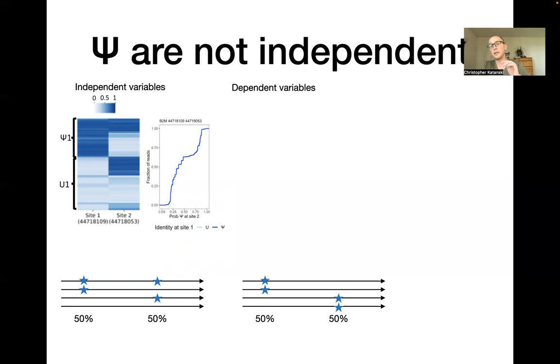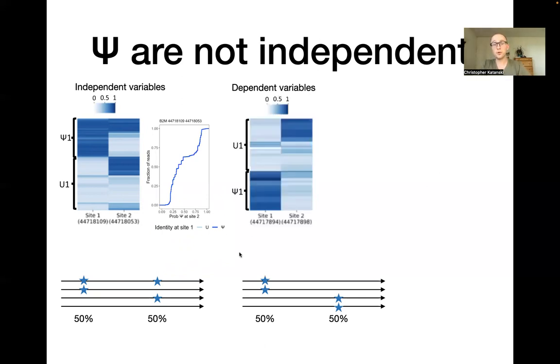The contrast is dependent sites. So there's obviously something missing. We've got one site modified but not the other, neither site modified, and one site modified but not the other, but we never see both sites modified when looking at these 2 positions. So we know that these are dependent sites. And we can get a p-value by looking at a KS test between the probabilities here.